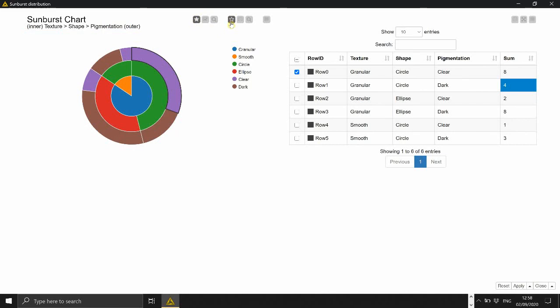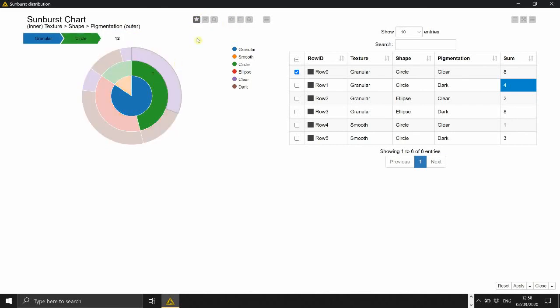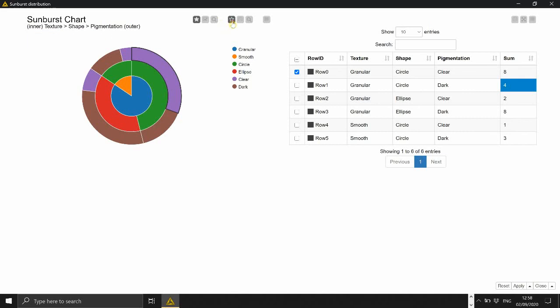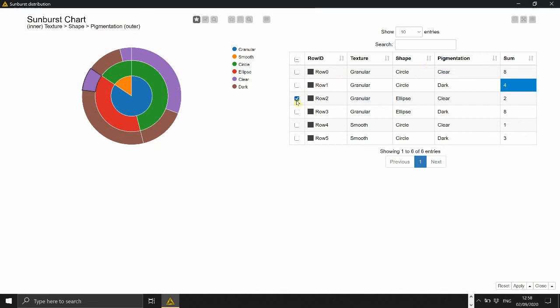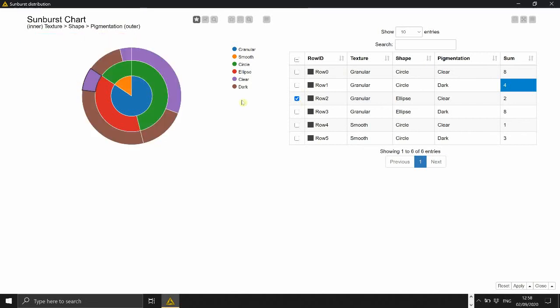So it's interactive in both directions so if you also select here it's highlighting if you select in the table it's highlighting the corresponding section in the plot.